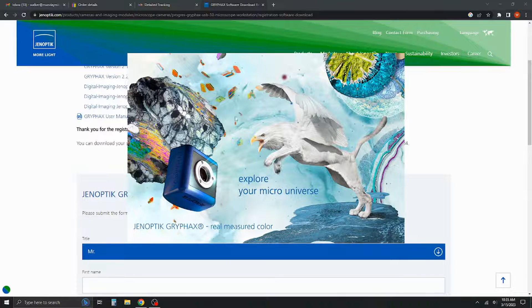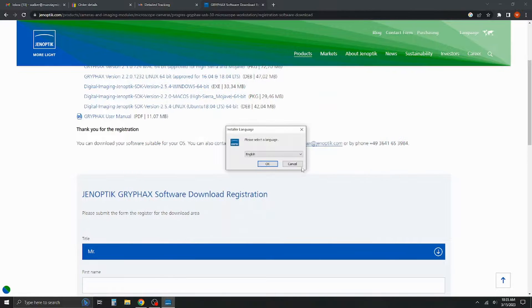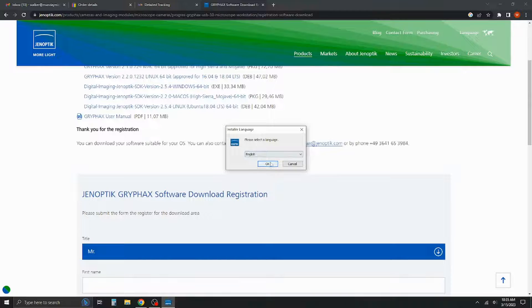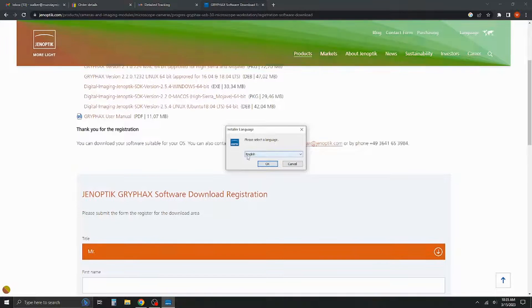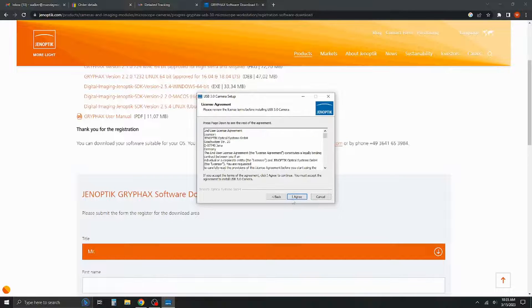This is the launch splash screen. We're going to select our language. You select what language is going to be presented to you. I'm going to go with English. We're going to hit next.